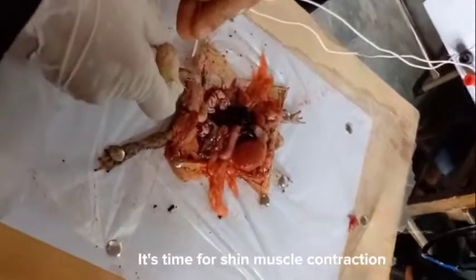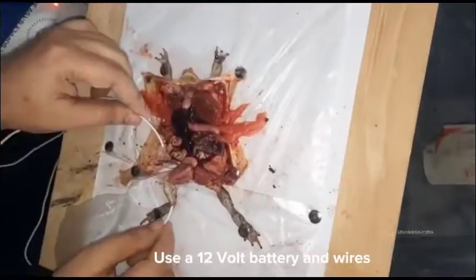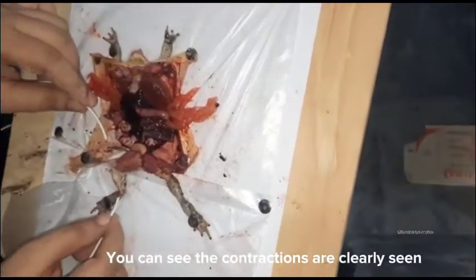It's time for shin muscle contraction. Use a 12-volt battery and wires. You can see the contractions are clearly seen.